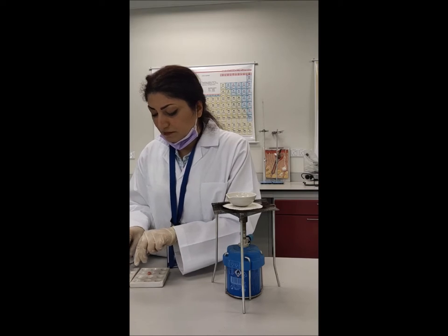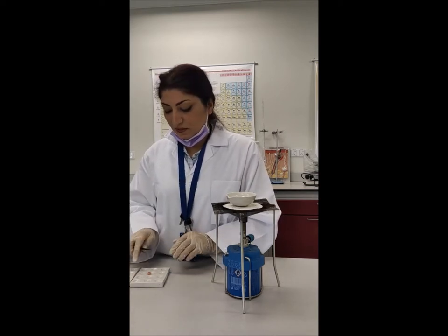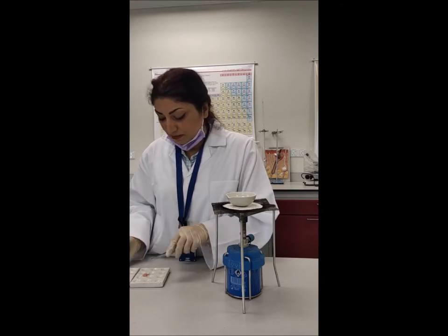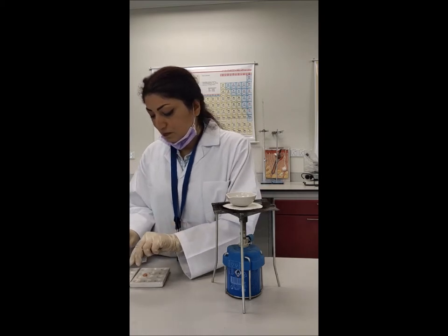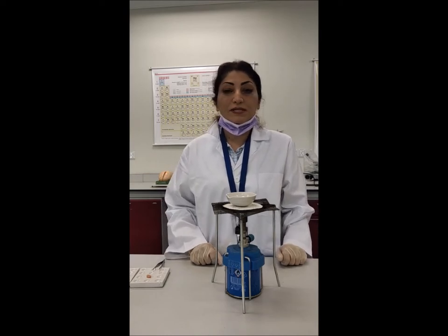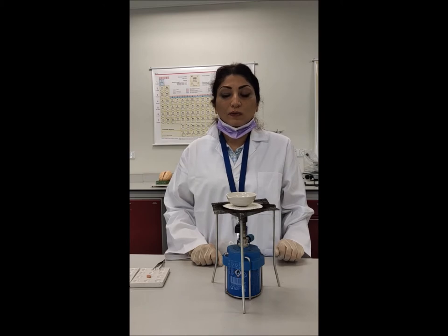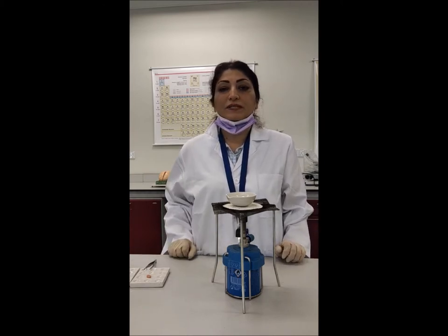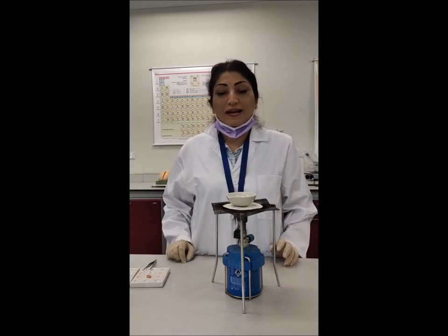I keep the rest in case I make a mistake and need to repeat. I take this tissue — it has a little extra fold which I remove. The wax in the container is not yet liquid. Once it turns to liquid, I'll wait a little for it to cool, then place the sample inside it and wait for the sample to get molded inside the wax.